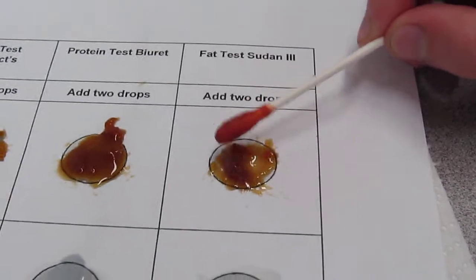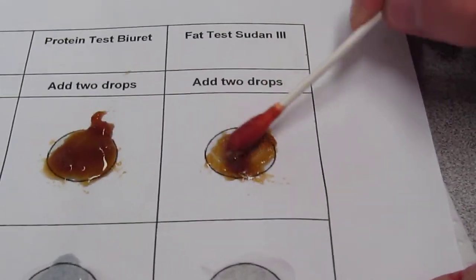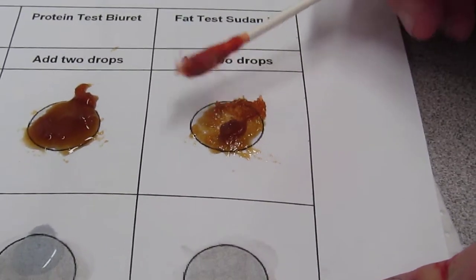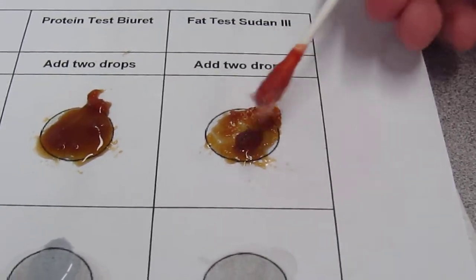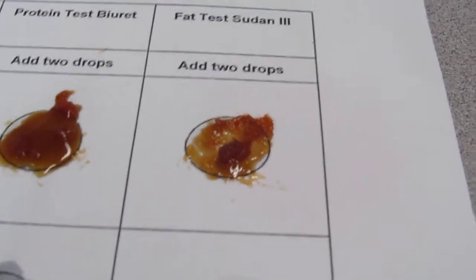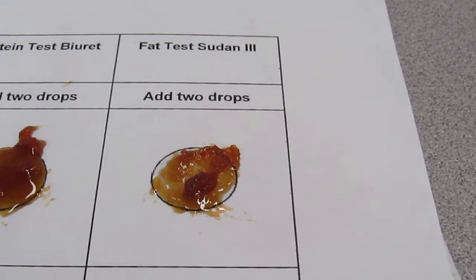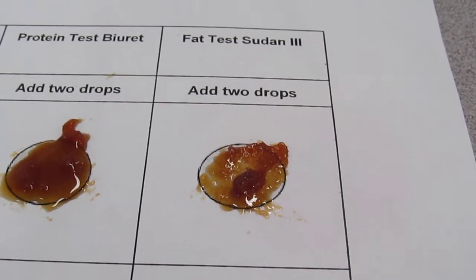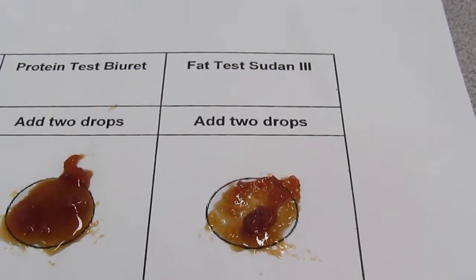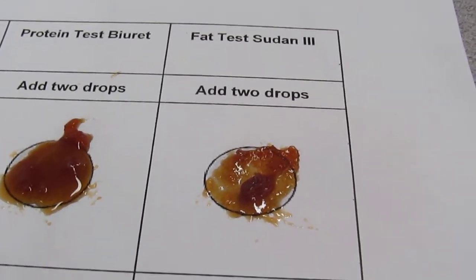Brian's going to put a little Sudan on. Does Sudan do anything to it? Sudan's going to test for fat. We should probably just pour it on. Don't pour it, because it's going to pour across your whole paper. But if there's no change, is there any fat in honey? No. But it looks kind of yellow. So it looks yellowy-red — so there could be fat in honey. If you get a color change, that means what? It could be.